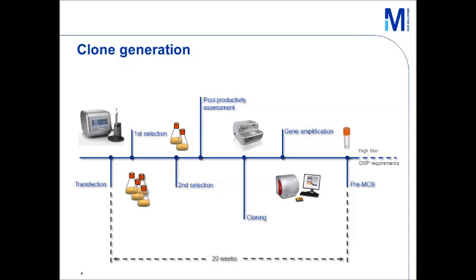So we do that in a very basic way, which is first of all the transfection of the DNA coding for your drug in order that the protein expression in the cell line allows the production of your drug. This is not something revolutionary. People do that for the last 40 years, but we have to do that. Then we perform a first and a second selection step, which allows us to ensure that the clones that we are going to work with, the pools of cells that we are going to work with, are made of cells which are transformed or transfected with your DNA of interest.